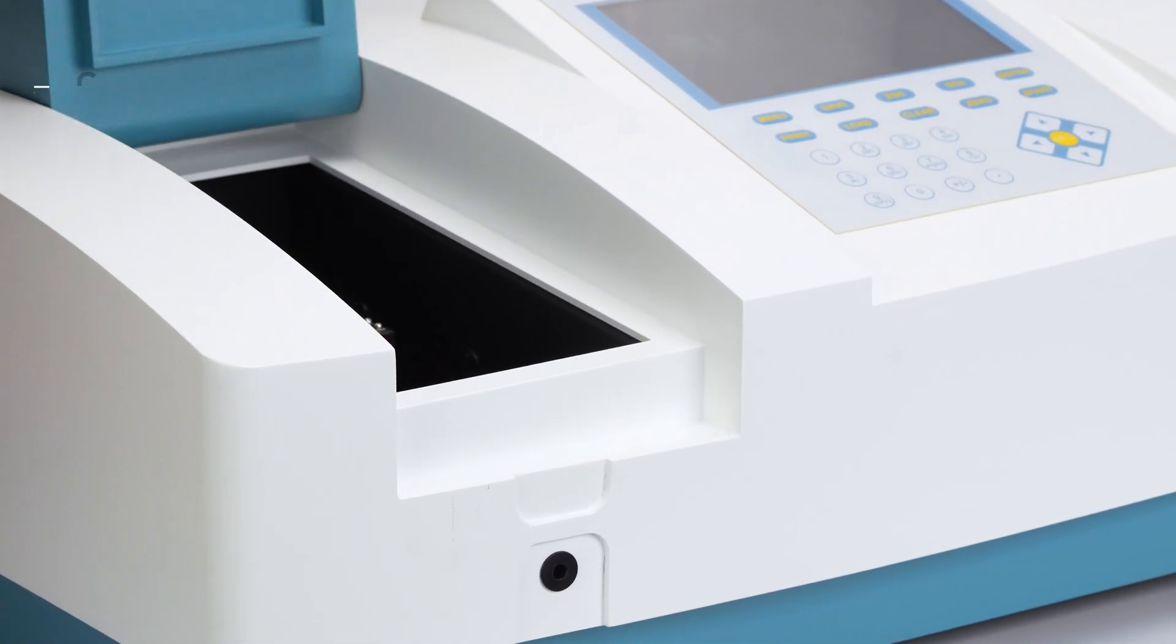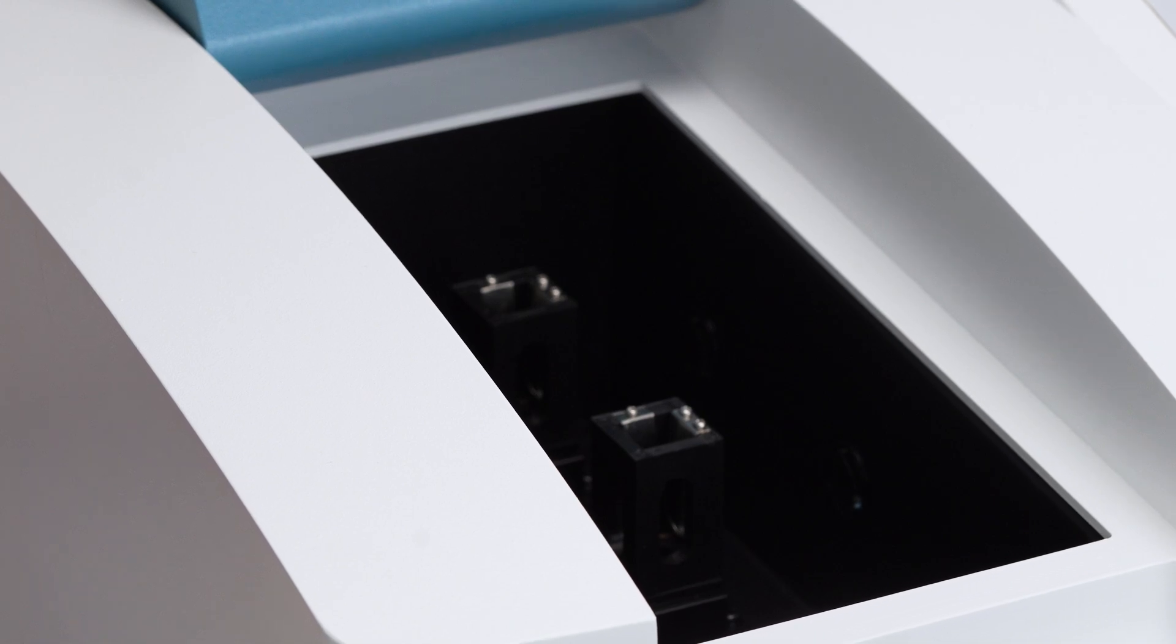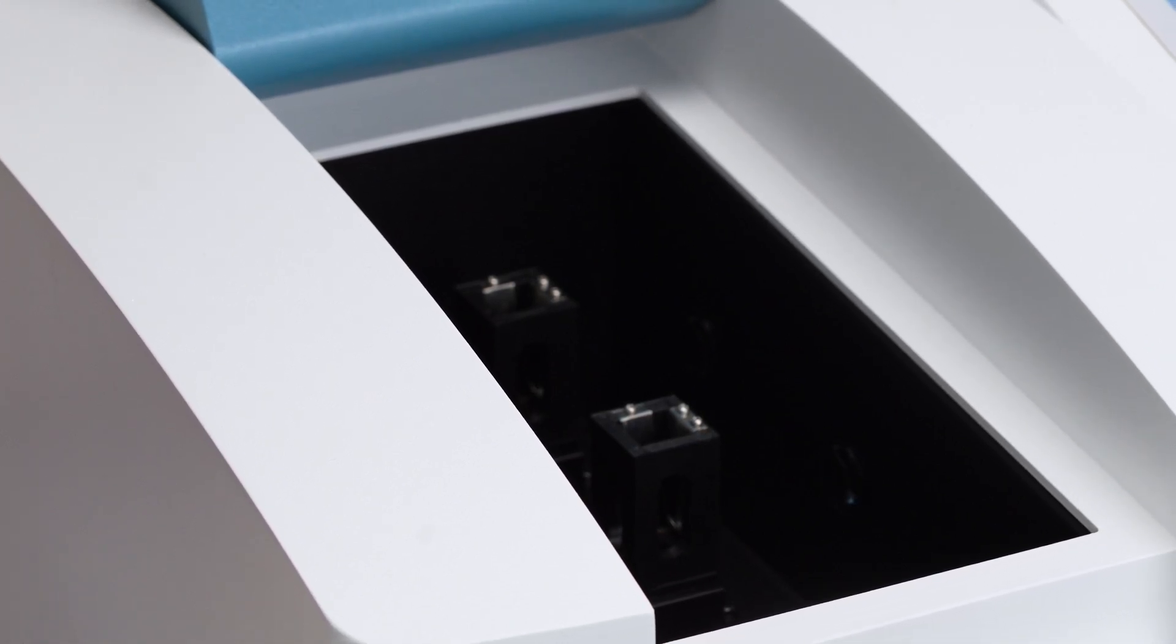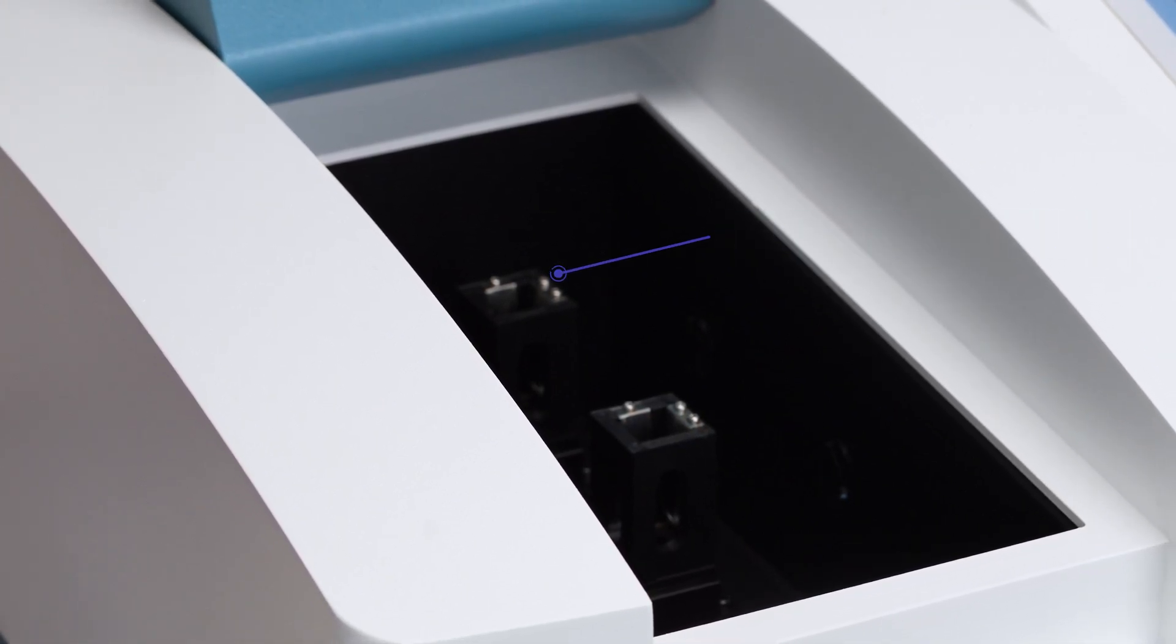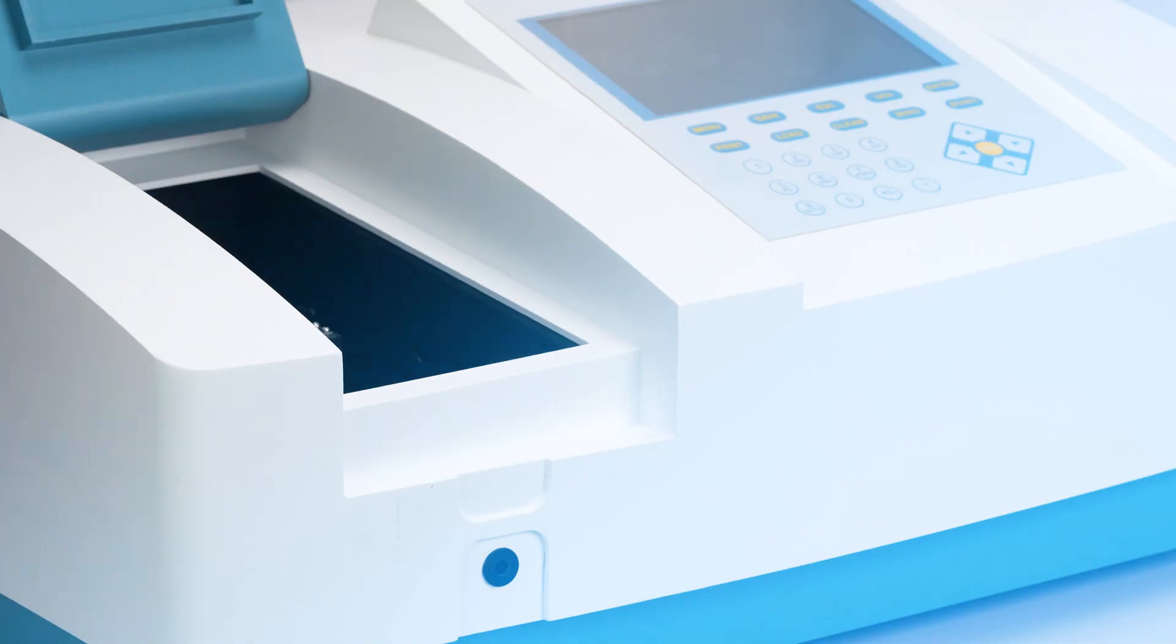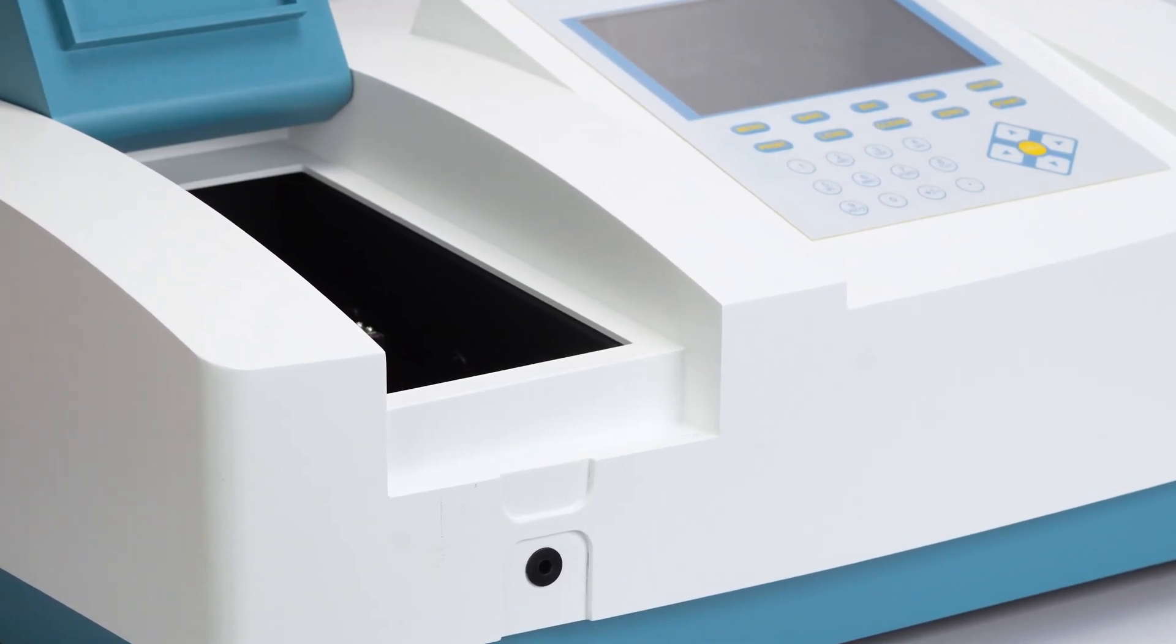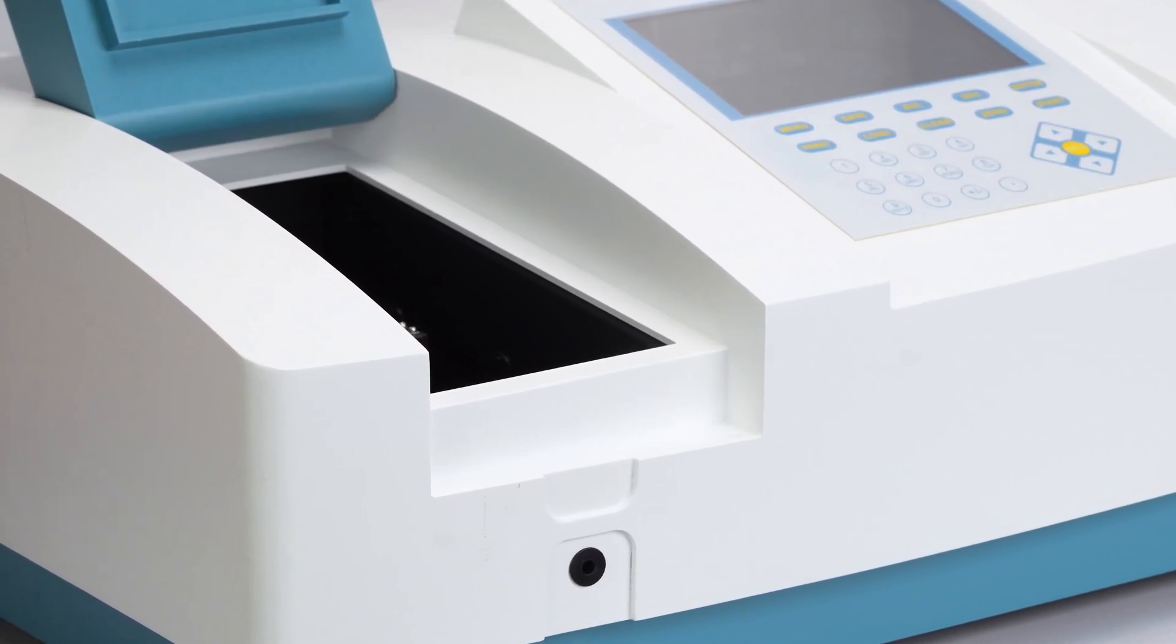The UV1950 compartment features two cell holders: the reference holder and the sample holder. These holders ensure accurate measurements by comparing sample readings against a reference.